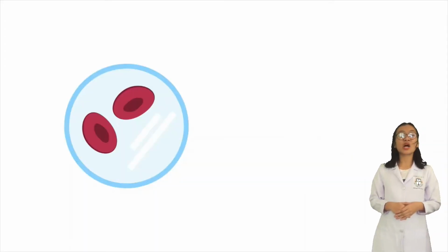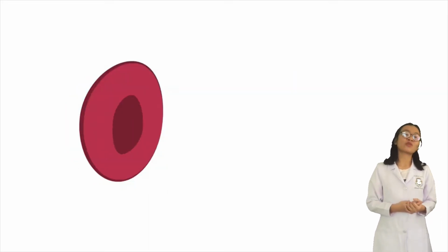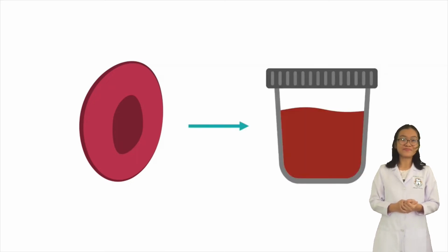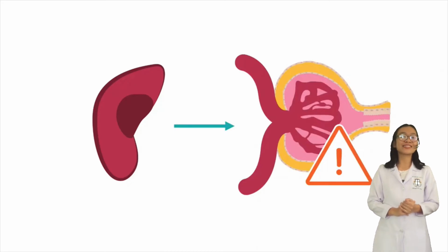Microscopic hematuria is commonly defined as the presence of 2 or more red blood cells per high-powered field in a spun urine sediment. Isomorphic red blood cells have an appearance similar to erythrocytes in the circulation, which are small, non-nucleated biconcave discs and can be seen with any cause of hematuria. By contrast, dysmorphic red blood cells have altered morphology and their presence is suggestive of glomerular disease.